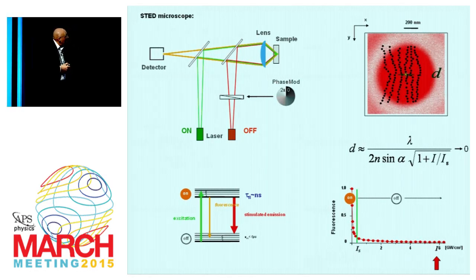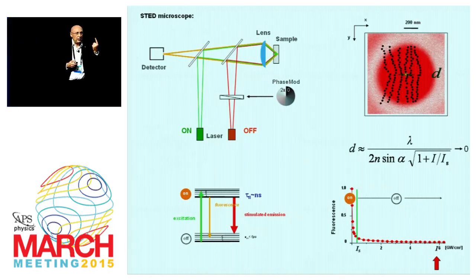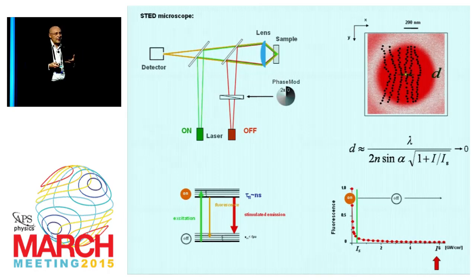Of course, if all the molecules here are dark, totally dark, one photon is absolutely enough to identify the molecule in here, because the position of that molecule is firmly determined by the photons that fall on the sample, by the red photons. So in other words, the conceptual limit here is indeed the size of the molecule. So the new resolution limit, if you like, is the size of the molecule. This is not surprising because after all, we separate by having molecules in two different states. So the molecule is the smallest separable unit, if you will.